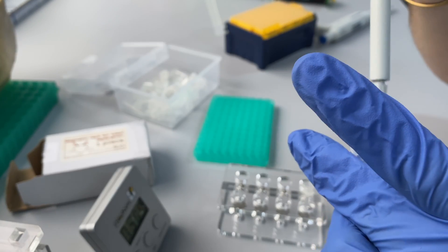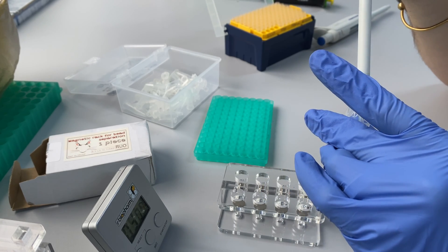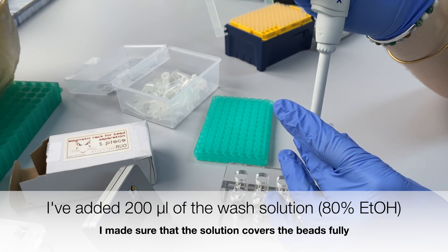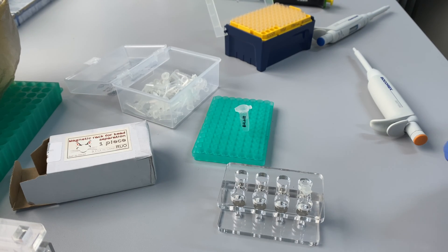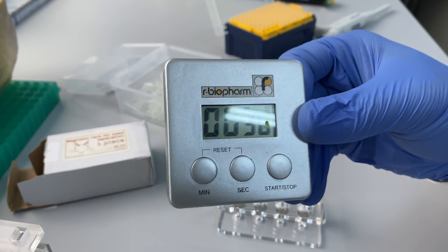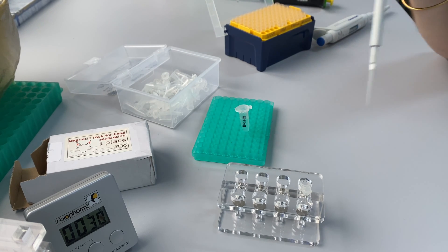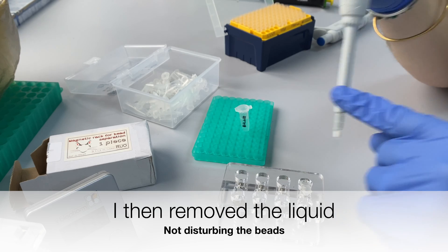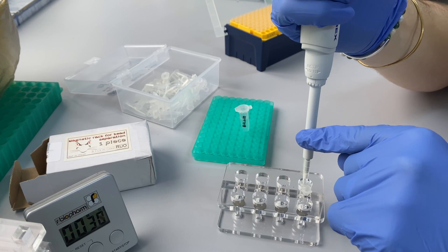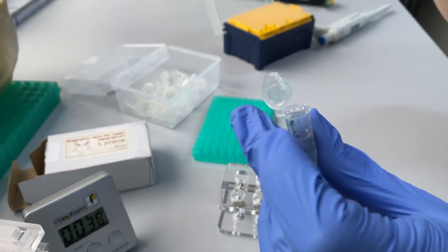Then came the washing step. With the beads still attached to the rack, I added 200 microliters of the wash solution — I did not mix or disturb the beads. I incubated for 30 seconds, then carefully removed all the liquid without disturbing the beads. I repeated this wash step one more time.